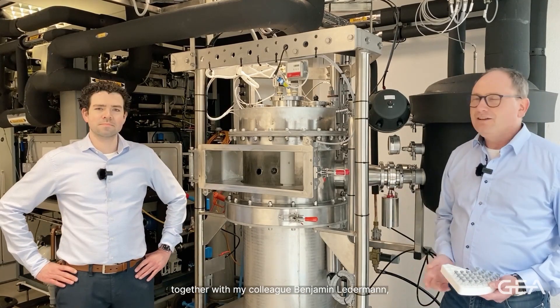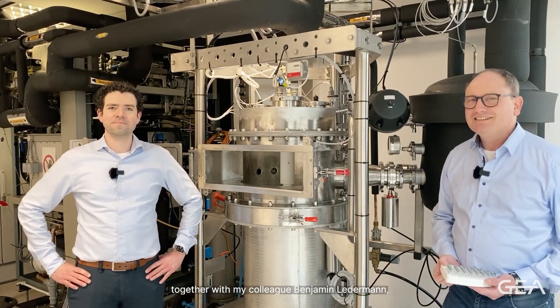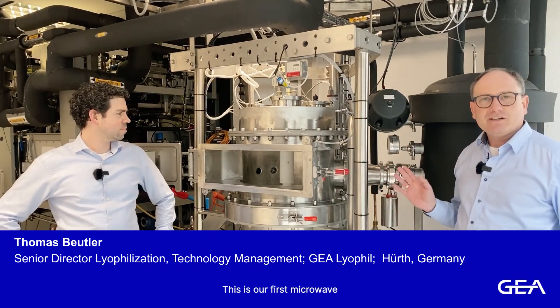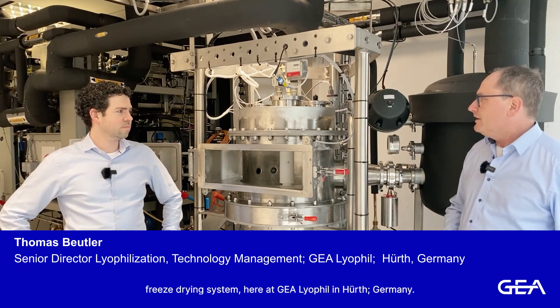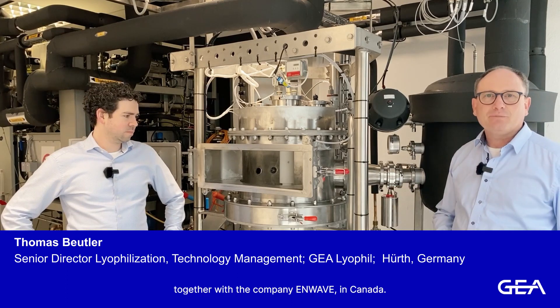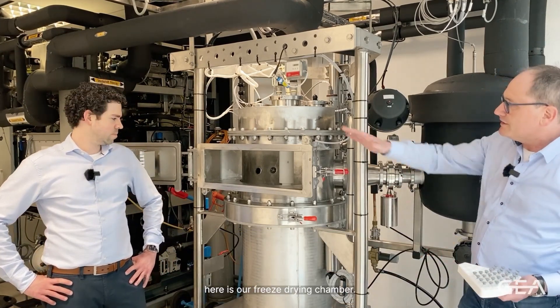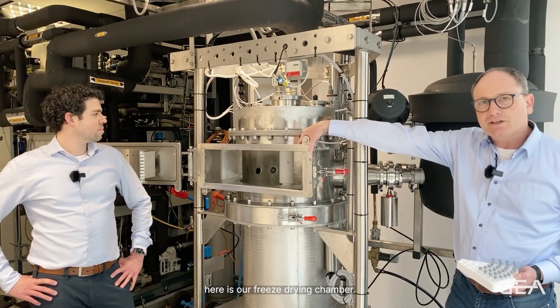I'm here together with my colleague Benjamin Ledermann, and let me first explain a little bit about the new equipment we have here in the lab. This is our first microwave freeze drying system here in Hürth, and this machine is designed together with the company EnWave in Canada. What you see here is our freeze drying chamber.